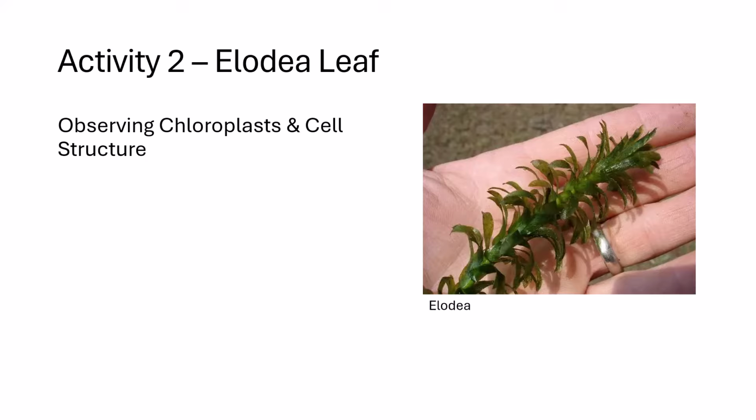In this activity, we'll be examining Elodea, a common aquatic plant that is widely used in biology labs because its cells are easy to observe under a microscope. This activity will allow you to clearly see chloroplasts and understand how plant cells are structured to carry out photosynthesis.